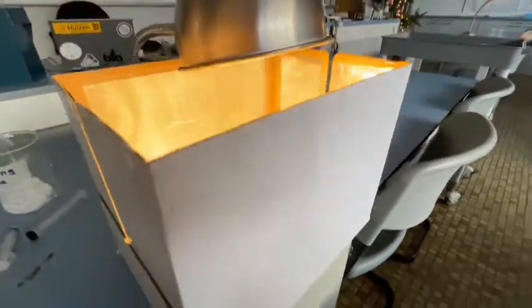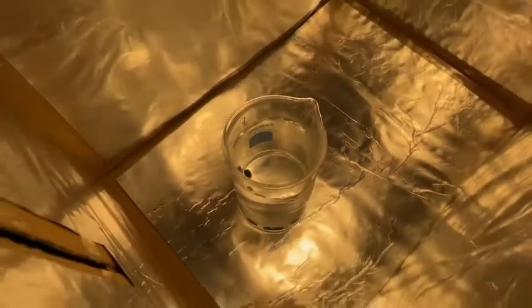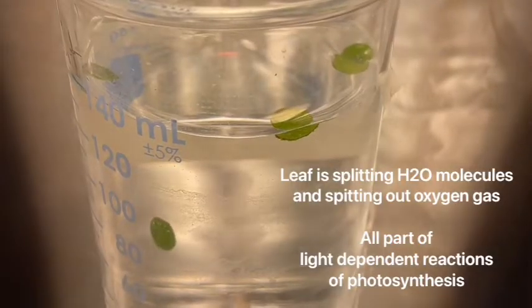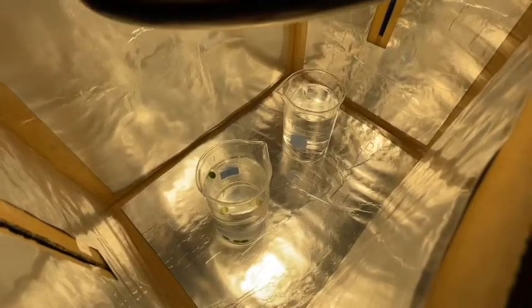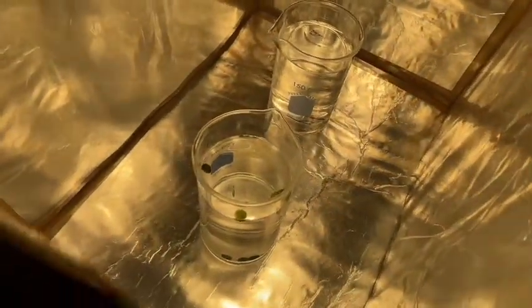So now at their station, students have this little light bath, and they can see if the leaves start floating at the top of the beaker. Students should be measuring that every minute. Students can use timers on their phone. They can be looking through the top of the box or through the side of the box. Whichever way they do it, every minute that passes, they should be recording in their graph the number of discs that are floating. Both pairs at the table can place their beakers inside of the photosynthesis light bath and do the experiment at the same time.